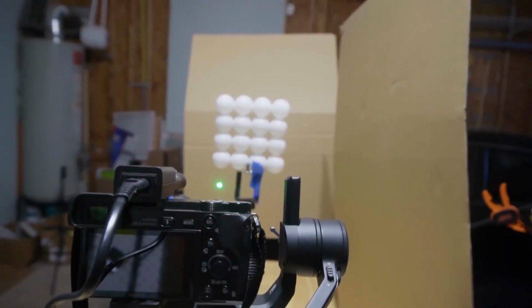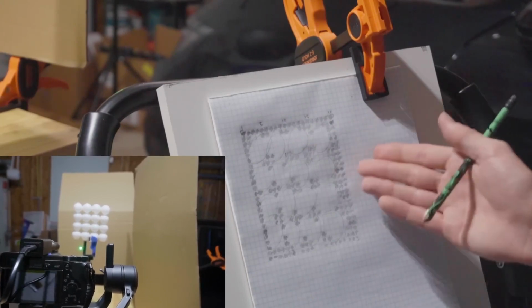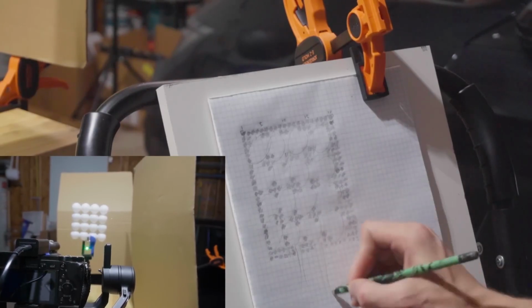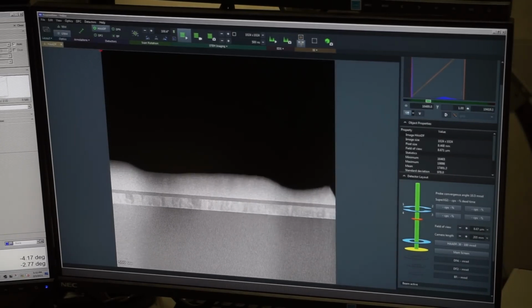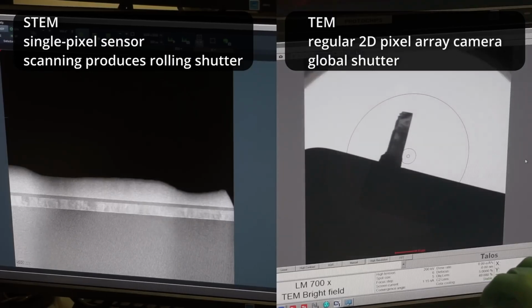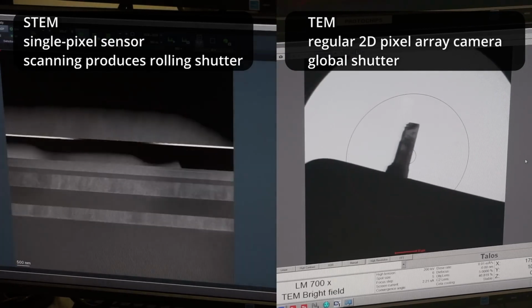In a real microscope, what I'm doing here would be known as a bright field image. I've just inverted it. So after minutes of filling in grid spots, I now have my picture of atoms, with some scan artifacts because I can't actually count. And if you imagine this happening really fast, where the computer guides a tiny beam of electrons across a sample line by line over and over again, you can imagine that images can get formed pretty quickly. In fact, that's what these scan lines are when you're watching any image on the screen. It's going over and over and over again, continuously refreshing the image one line at a time.